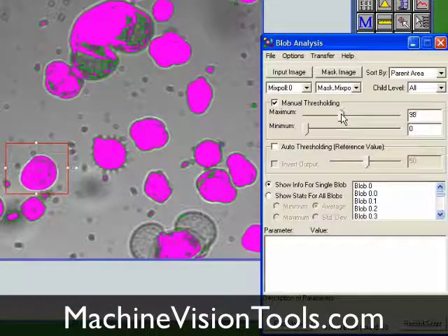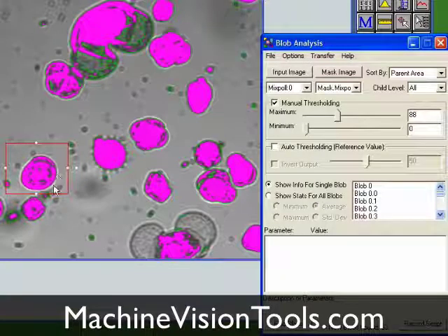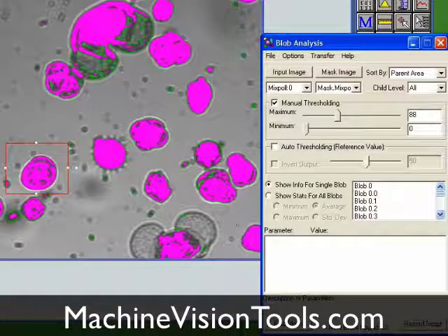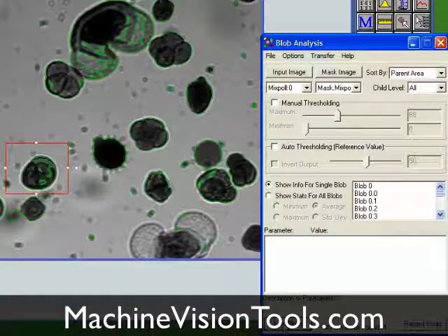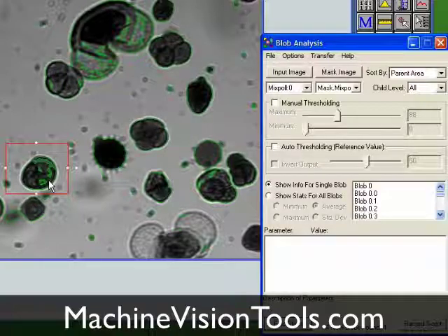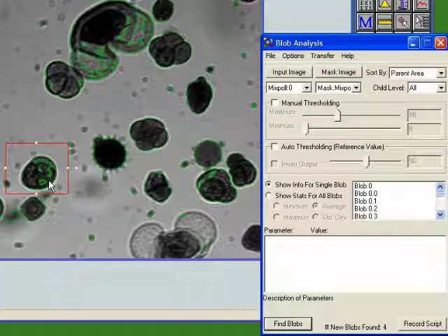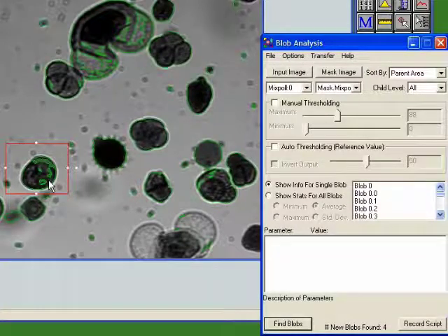Now we'll adjust our manual thresholding values so that the child blobs show up the way we want them, and when we click Find Blobs, you'll see that we've found that blob again with its child blobs without losing all the other blobs we'd found in the image before. All of the blobs we've found are now listed together in the blob analysis tool.